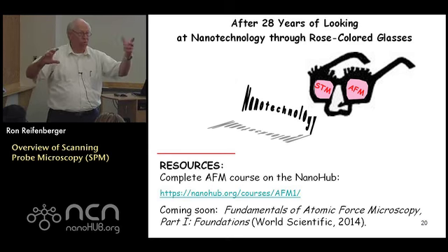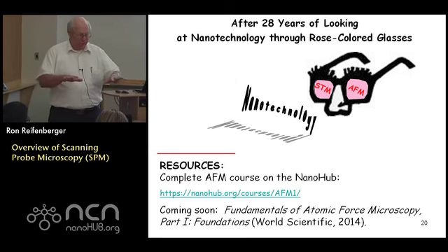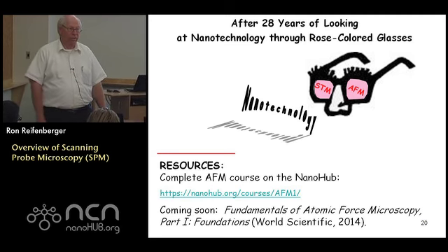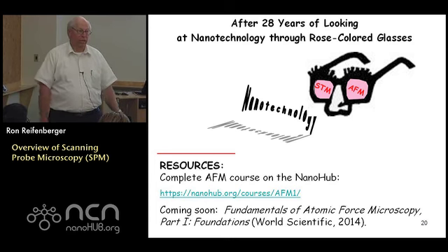They depend on voltages and things I don't understand. So, you know, if you're doing really careful work, you constantly got to be checking calibrations with the SEMs. And that means you have to have more than one SEM to do that. You know, if you're doing university work, it's probably not such a big deal, because, well, everything's got its pluses and minuses, right?